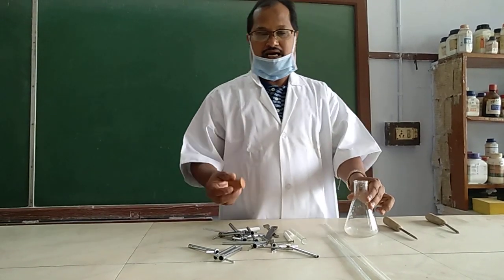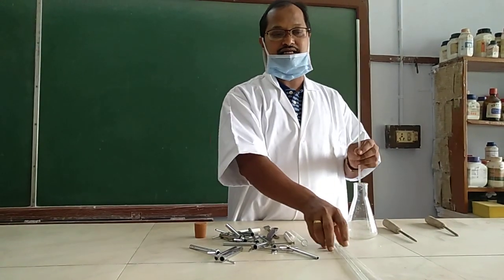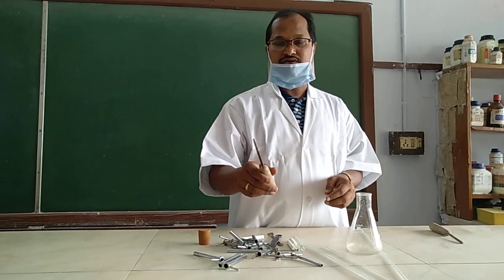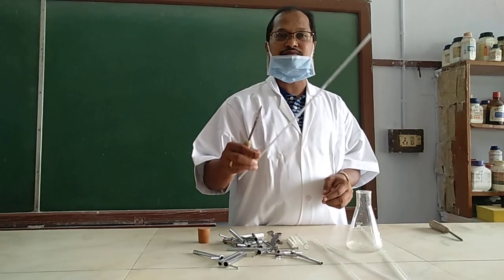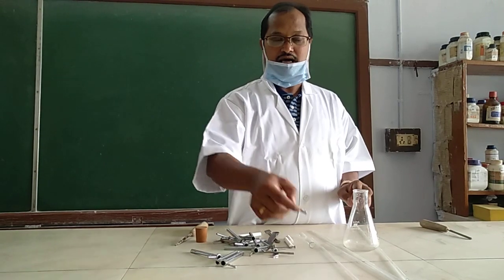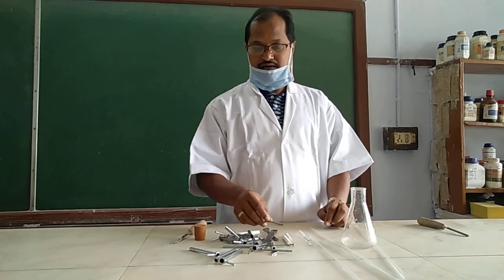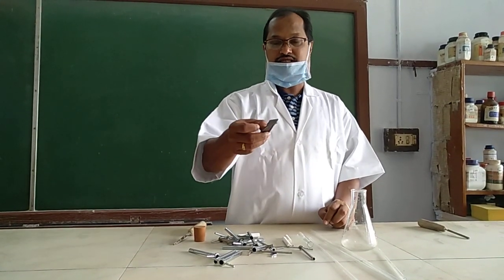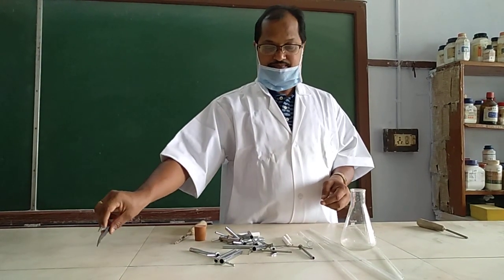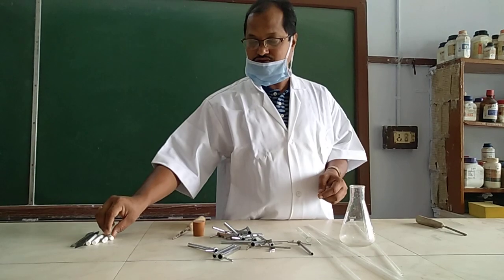Let us start the wash bottle - how it is prepared. This is the first practical. Here you can find a glass tube, and this is a conical flask. This is the file through which we will cut the glass tube as per our requirement. These are the borers through which we will make the hole on the cork. These are the spatulas used for carrying chemicals or salts. Observe it properly and watch very keenly.